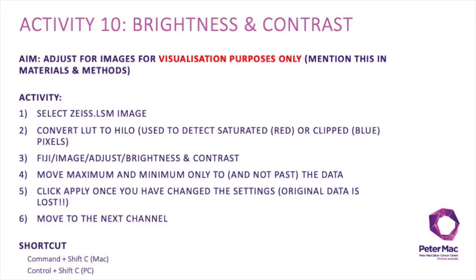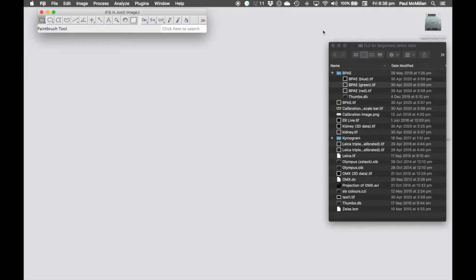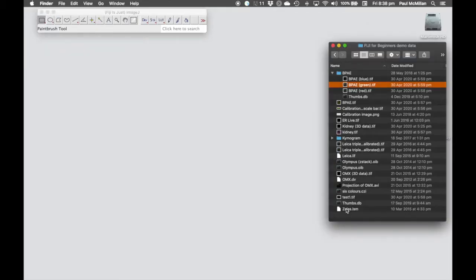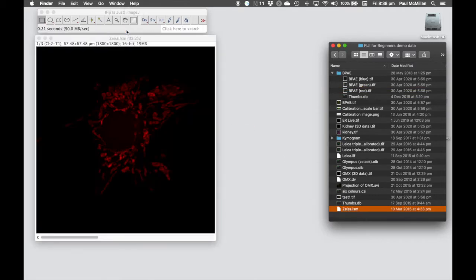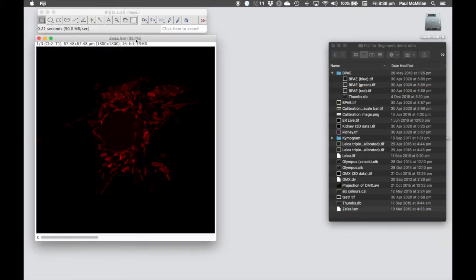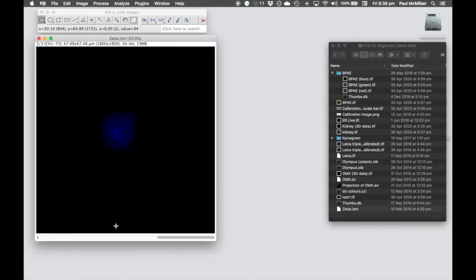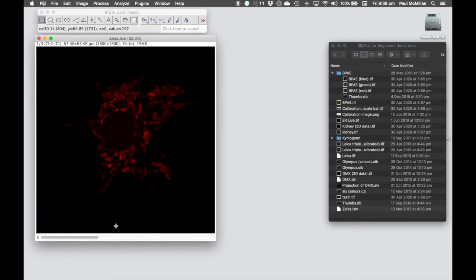Activity 10 is adjusting the brightness and contrast within an image. We're going to use this for visualization purposes only, just to make the data within the image a little bit clearer. For our example, we're going to use the zeiss.lsm image, which has three different channels.